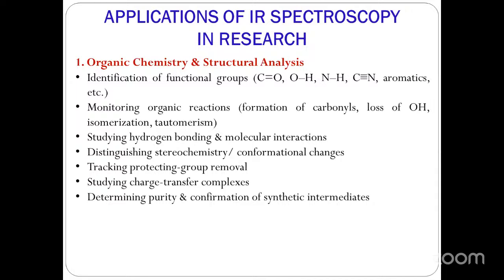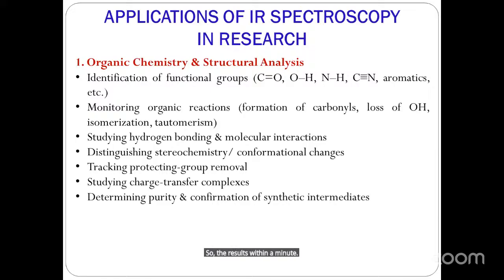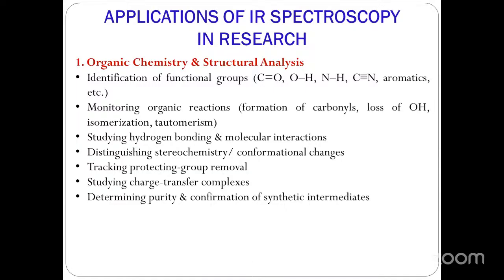And a very important thing, IR spectroscopy, as it gives you the results within a minute, we can monitor the reactions. So whenever you are performing any kind of reactions, immediate analysis of the product is very important.